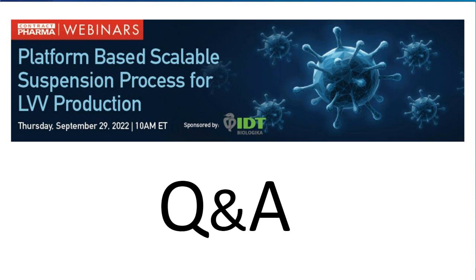First question. This attendee would like to know, what are some of the important factors that impact transfection efficiency?